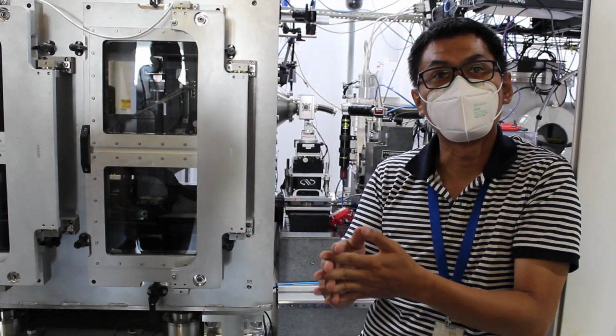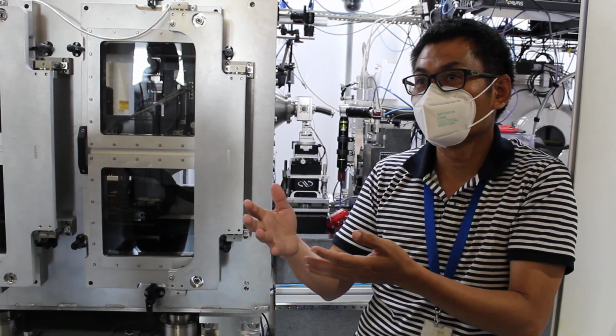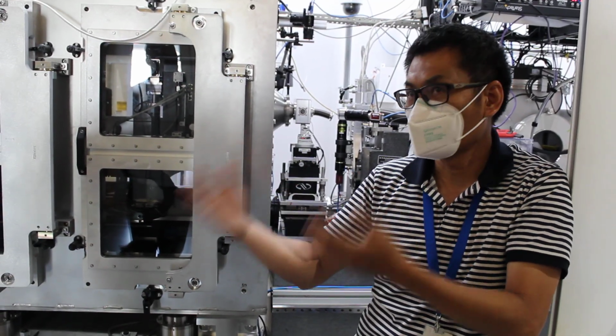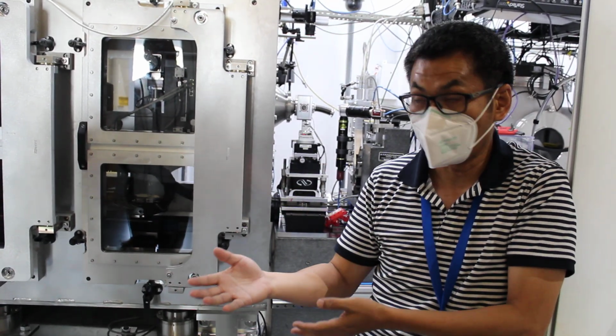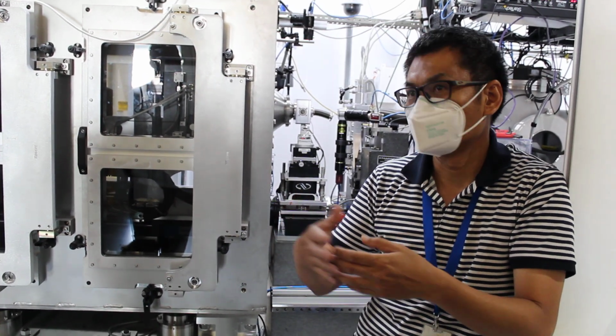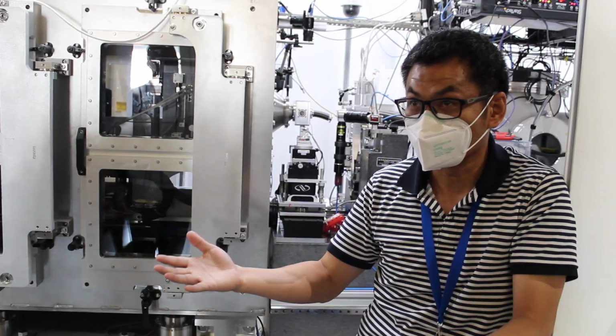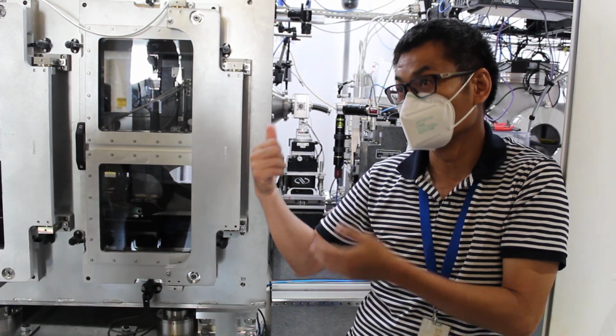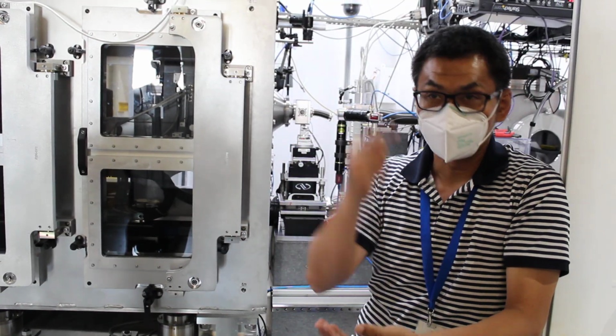So what you hope to see is, you can trigger some kind of structure change, either by, say, mixing the sample with some kind of chemical that you expect to interact with it, or maybe even by studying the impact of light or something like that. Right? So you hope to see a structure change, and that's reflected in the data. Right. So that's one thing we do.